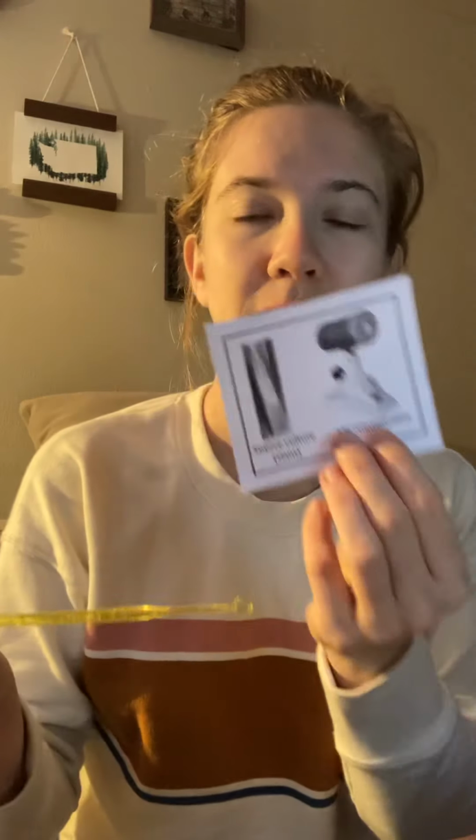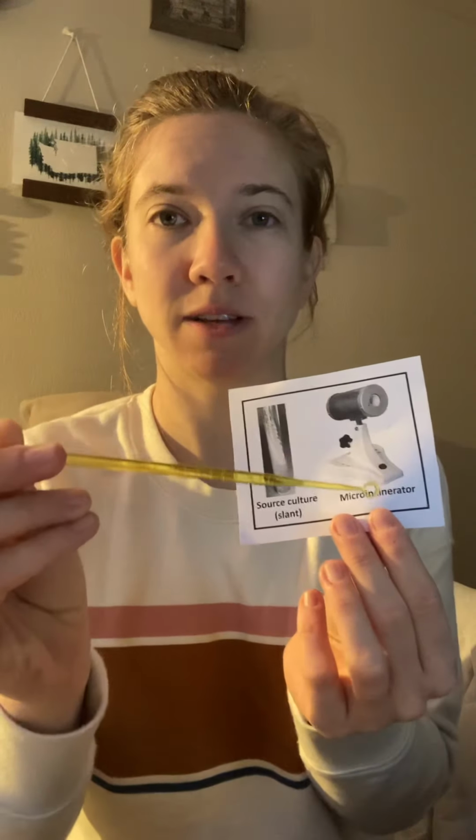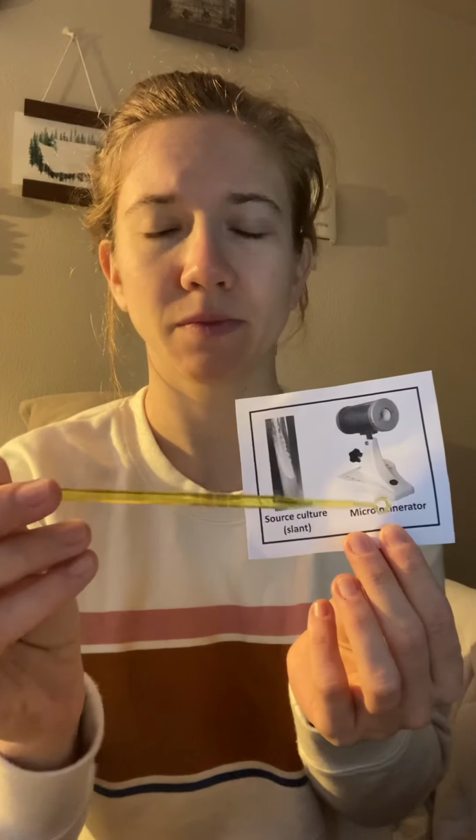As far as aseptic technique goes, with your inoculating loop and your micro incinerator that's been turned on for 10 minutes, so it's nice and hot, you're going to place your loop in the micro incinerator for about a minute, and then remove it and let it cool for about 10 seconds. If you don't wait those 10 seconds, it'll be way too hot and can kill off any bacteria.